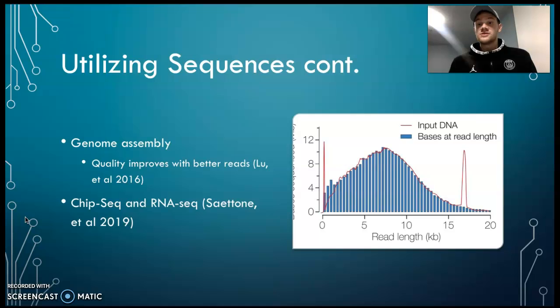Second generation sequencing reads will still produce a result, but the error rates may be high, and it may not be what you want. For ChIP-seq and RNA-seq, in my research, I found that Oxford Nanopore actually can perform these directly using the instrument, and they state that this allows for accurate quantification and complete full-length characterization of native RNA or cDNA without fragmentation or amplification. And what this allows for is streamlining analysis, and it removes the potential for biases within the data.